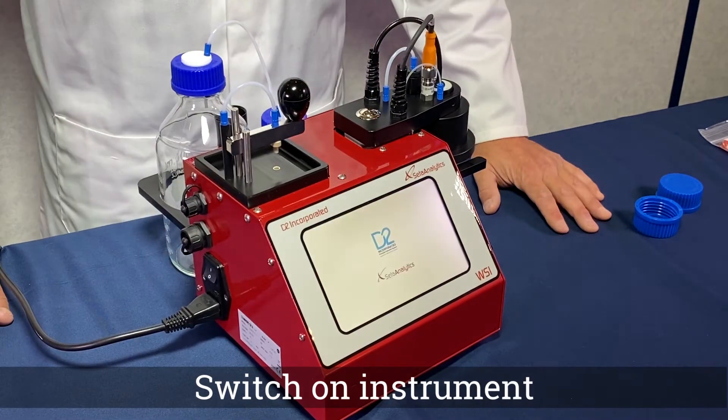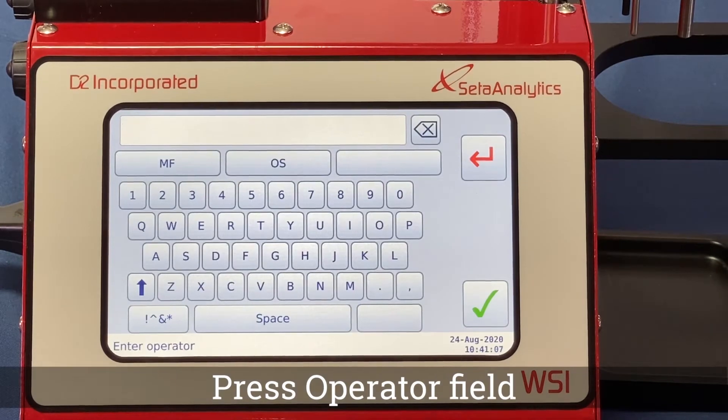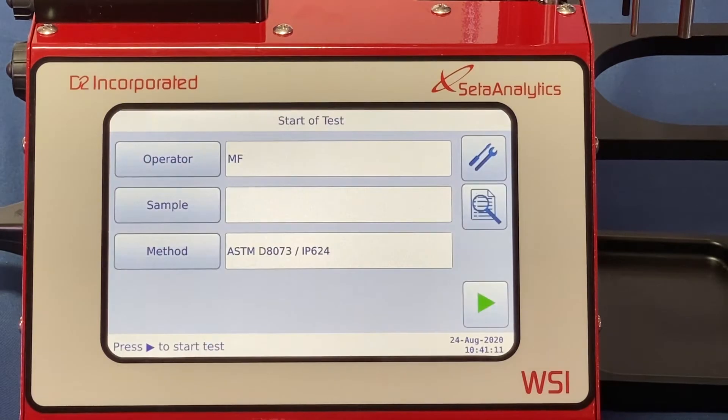Firstly, plug in the power supply cable and switch on. From the start screen, select the operator field and enter the user details. Press the green tick box when complete.